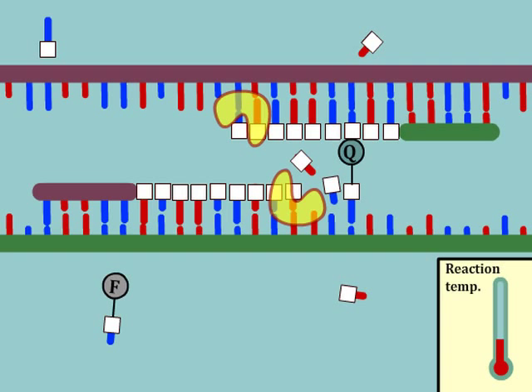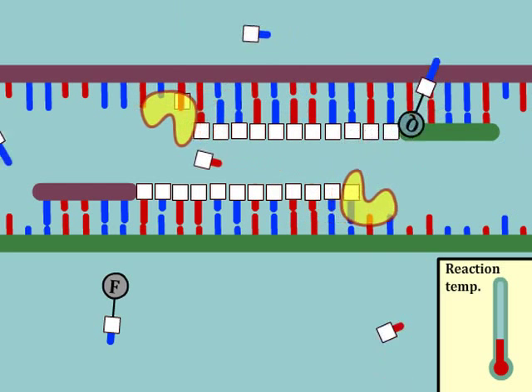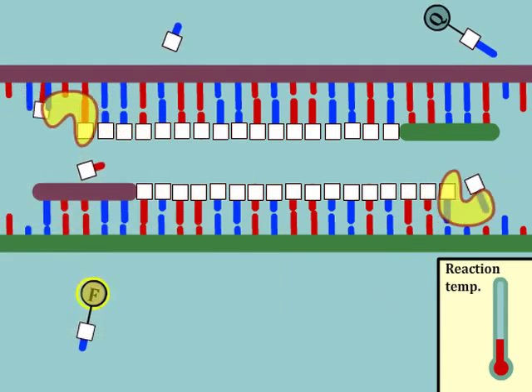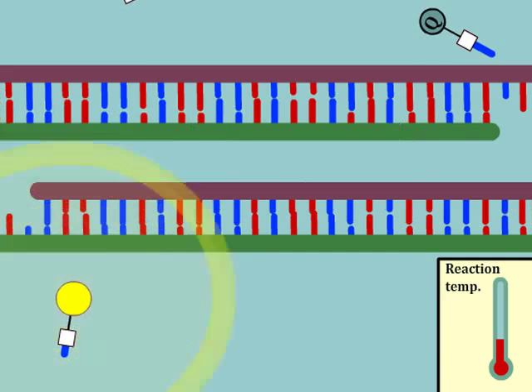As the polymerase cuts through the probe, note that the nucleotide bearing the fluorescent marker and the one bearing the quencher are separated from one another. In the absence of a nearby quencher, the fluorescent molecule can now emit detectable light when stimulated.